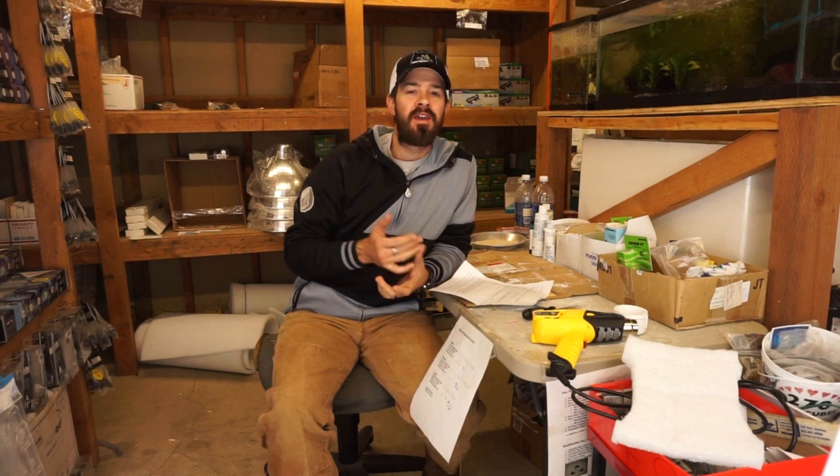Hey everyone, Devin here from American Aquarium. Thank you so much for tuning in. Today we're going to be talking about the freshwater test kits, what's needed and really what our objective is to have these test kits.